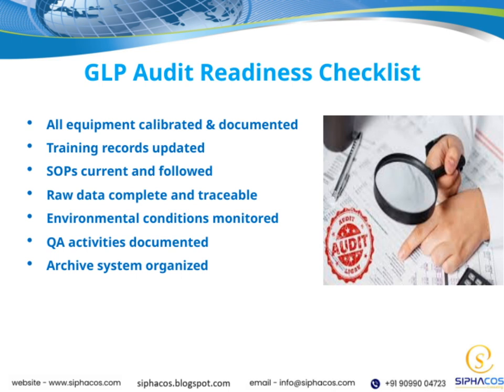Lastly, we review the GLP audit readiness checklist regularly to confirm that all aspects of our operations meet regulatory expectations. Altogether, these practices form a comprehensive approach to quality and compliance, which is at the heart of our overall success and integrity in scientific work.